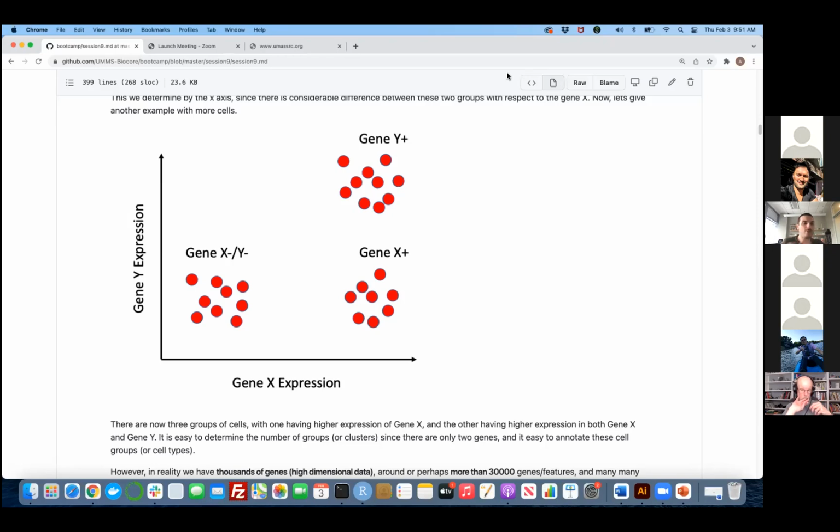But how many genes do we have? We have 2 in this graph, but thousands in cells. Exactly. So which ones? The interesting thing is that I had only 2 genes over here, but we have thousands. So we have to find these subpopulations in a space that is defined by 30,000 dimensions. So the entire single cell data analysis workflow is based on lowering this number of genes to some subset, exactly what Alicia said, to choose some genes that are better indications of the cellular populations first.